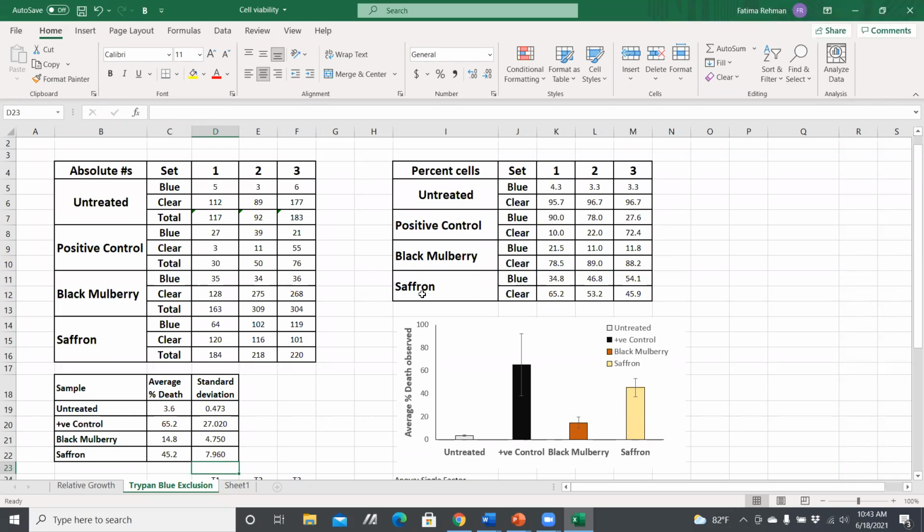Because the numbers are related to each other. It's from the same sample. Yes. There are only two groups, right? It's not like there were 3 or 4 or 5 categories. They're just 2 categories within that group. So those numbers are going to be directly related to each other, and you'll get the exact same standard deviation. Okay, so now you have the correct standard deviation.